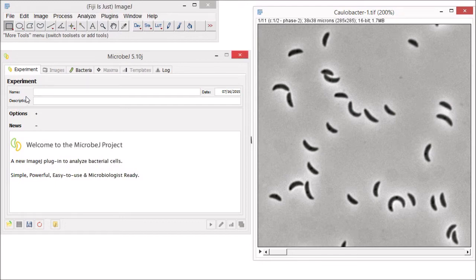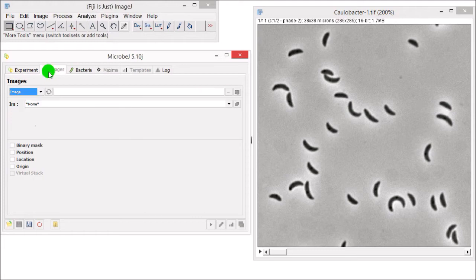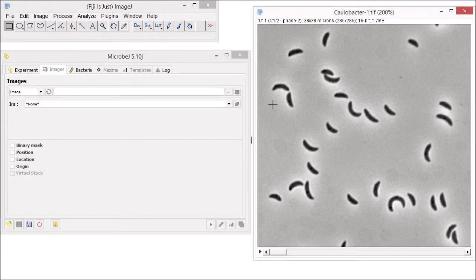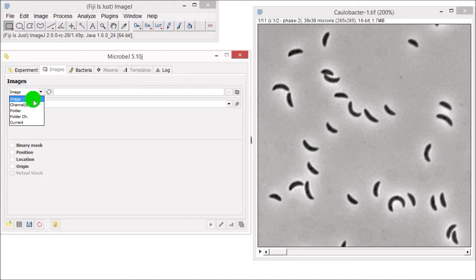On the Experiment tab, you can specify a name and a description for your experiment, but it's not mandatory. We currently have a stack of phase contrast images open on the desktop. To select this stack of images in MicrobJ, go to the Image tab and select Image as the input mode. There are a lot of other ways to open and select images in MicrobJ, but we'll explore those later.